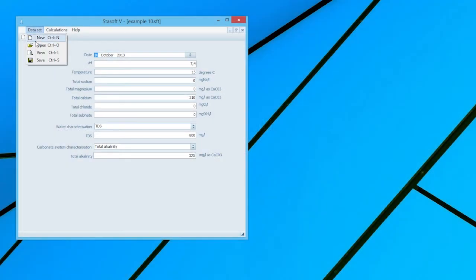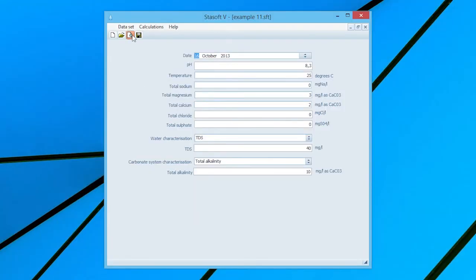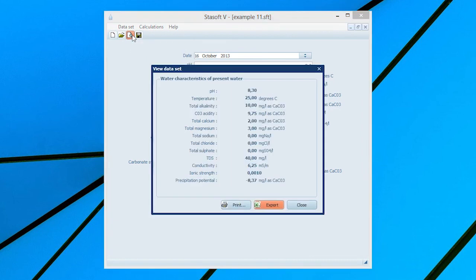Stabilization of Calcium and Carbonate Species Deficient Water. Select Dataset 11 for Example 11 in the manual. After entering the data into the Dataset input window, selection of the View option will bring a window displaying the characteristics of the present water onto the screen.